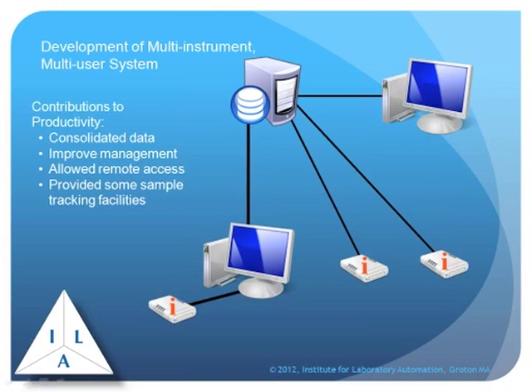You have remote access. So if you're working from home or outside the laboratory and you want to find out how your work is going, log into it and take a look at the data. And these systems also contain a rudimentary laboratory information management system. They'll track samples, they'll track users. So if your laboratory all has one type of instrumentation, a system like this might be all you need to support it. You can do all the sample tracking, logging, data acquisition, data analysis, all from one platform.